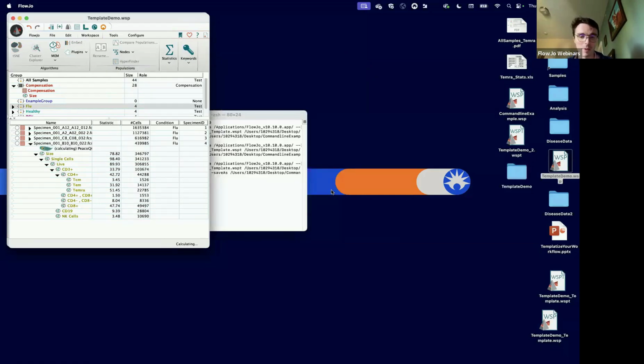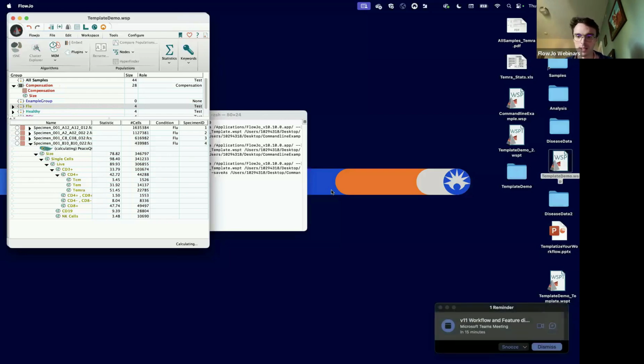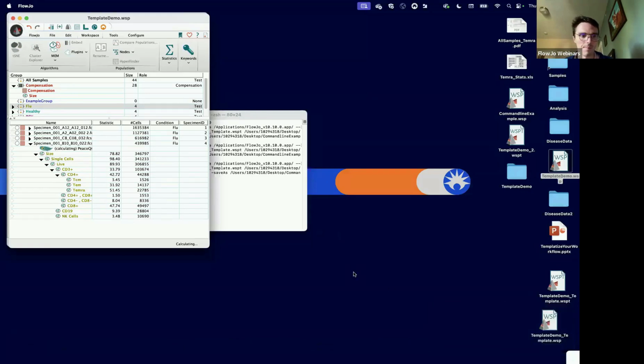For anyone who's not familiar with plugins, that's a whole separate webinar you'd probably have to watch. But there are third-party algorithms that are available in FlowJo. These are tools developed by third-party researchers. PeacoQC was from the SAKE lab. And so yeah, we're running PeacoQC.